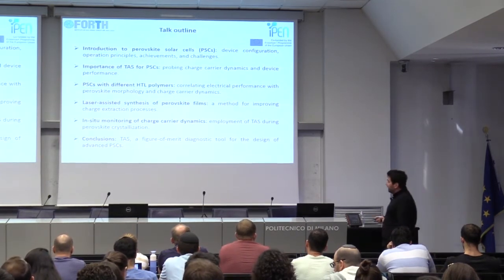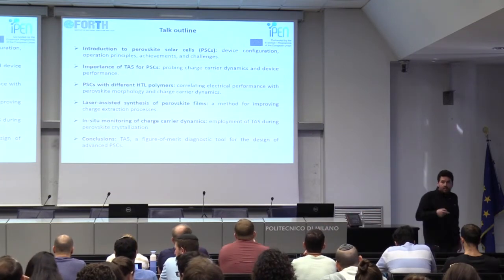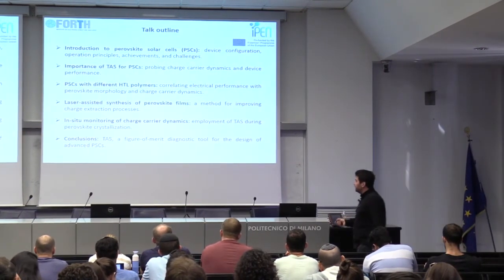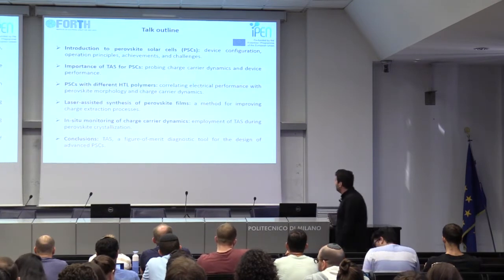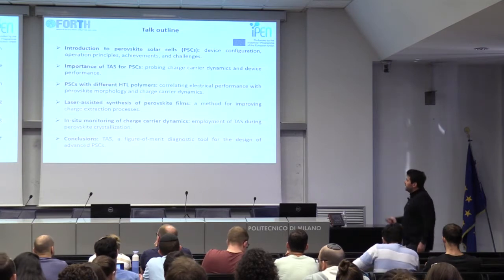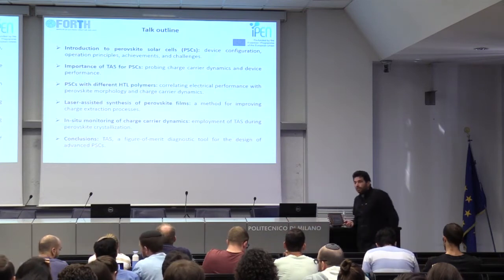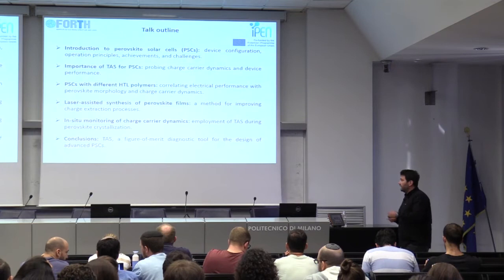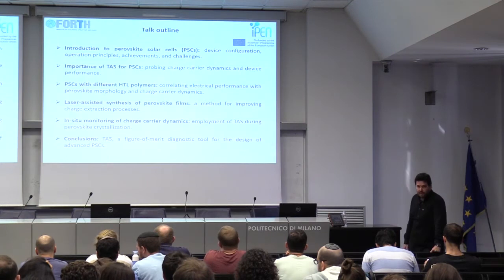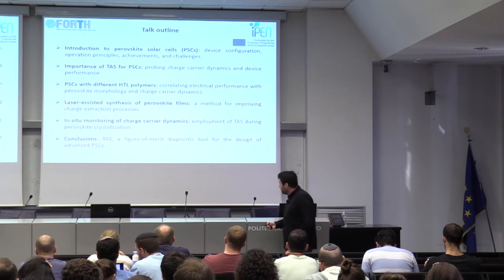Then I will speak a little bit about a method to develop perovskite films without doing thermal annealing, which is a typical method for making the films. And it is by means of laser-assisted crystallization. And we believe that this is a method for improving charge extraction processes. And then, at the final part of the talk, I will talk about how we perform in situ monitoring of the charge carrier dynamics of perovskites while doing transient absorption spectroscopy during the perovskite crystallization. And then I will summarize with the conclusions.